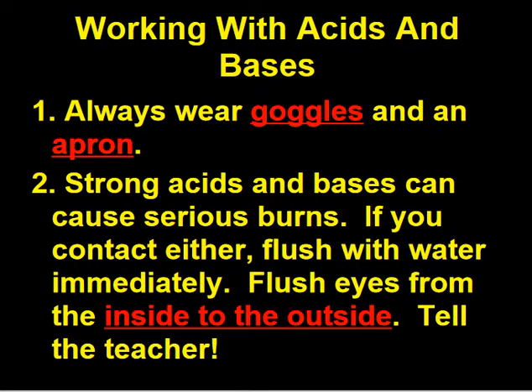When you're working with acids and bases, always wear goggles and aprons. Remember, strong acids and bases can cause serious burns. If you contact either, flush with water immediately. You may have to flush your eyes out for 20 minutes or so, and flush from the inside to the outside so you don't cross-contaminate. Say you only have one eye that has some acid in it, you don't want to get acid in the other eye. And let me know. Obviously if you get acid in it, you're probably going to be screaming, and we'll get you up here and work with you on the emergency shower. We'll get you the help that you need.